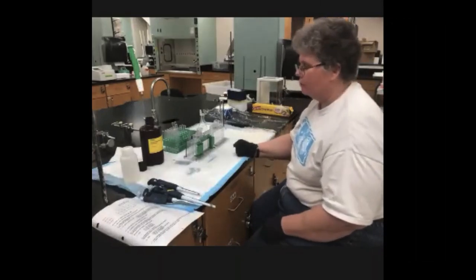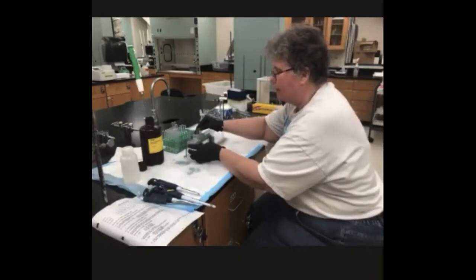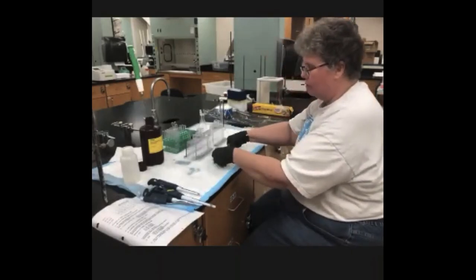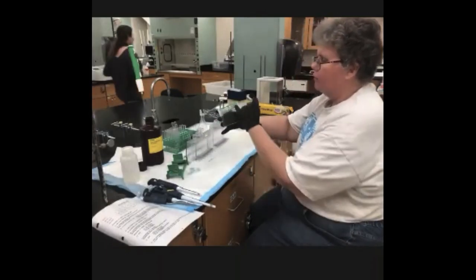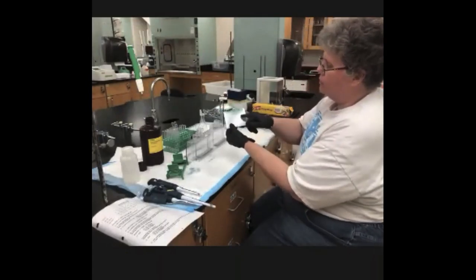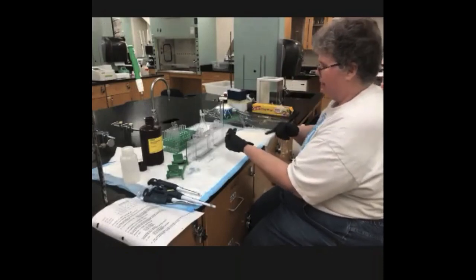After your gel's polymerized, you're going to take it apart and store it until the next lab period. So you're going to press on the clamp to release it. You're going to release it from the green clamp, and then you will just have your two glass plates together with the comb in the middle. Do not take out the comb. If you look carefully, you can see the line here between the two different percentages of acrylamide.